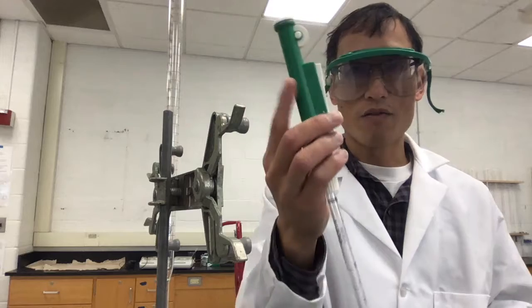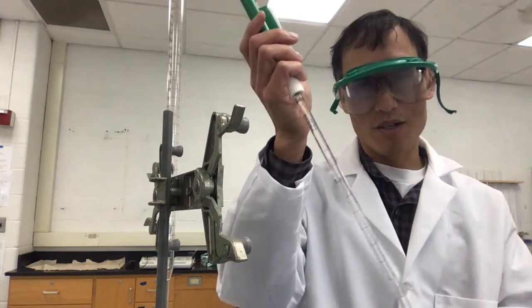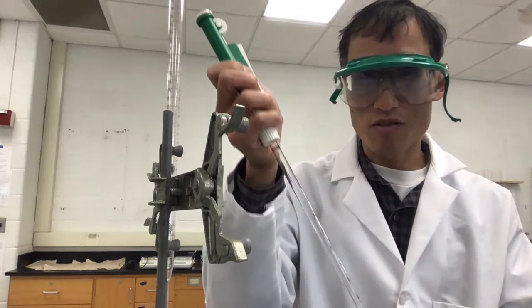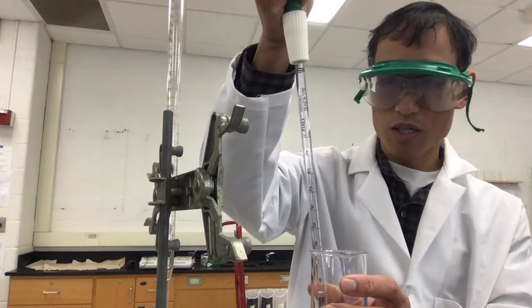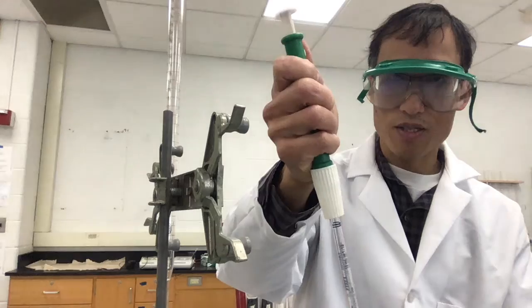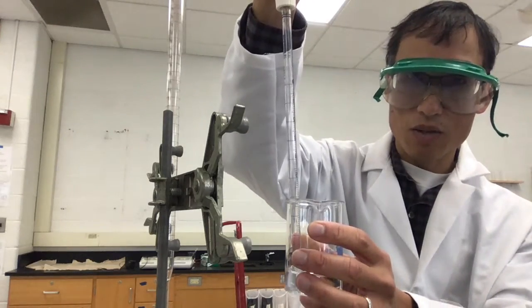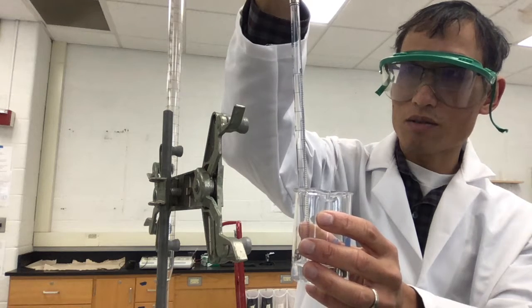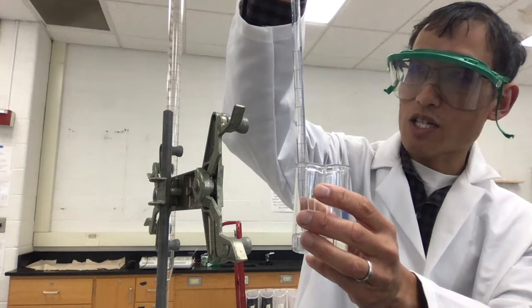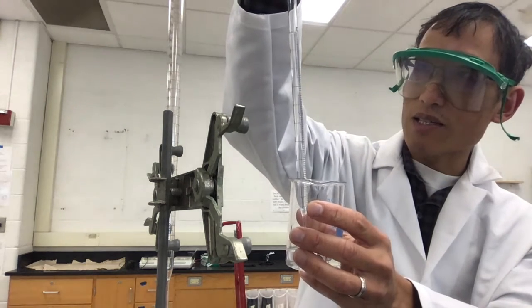So this is a pipette pump. Also, another sad thing that you won't get to use until you get to probably college. You draw this up, you just turn this thing here like this. You can see the liquid going up here. And you get to exactly 0. And you have to check it, just make sure it's exactly at that line.